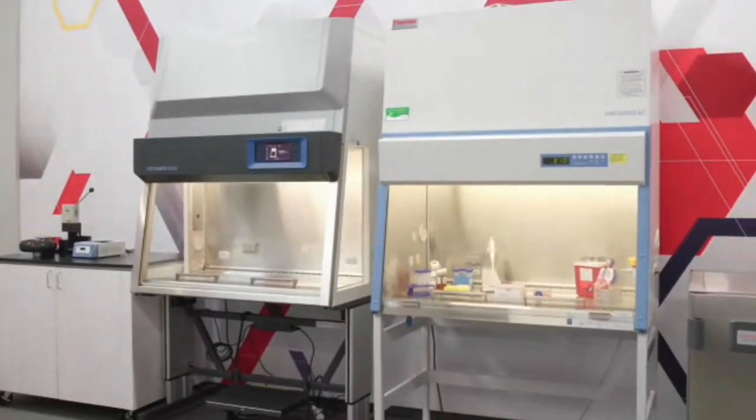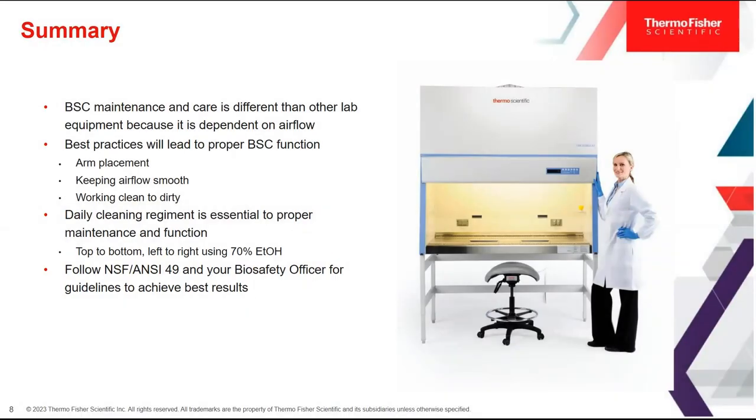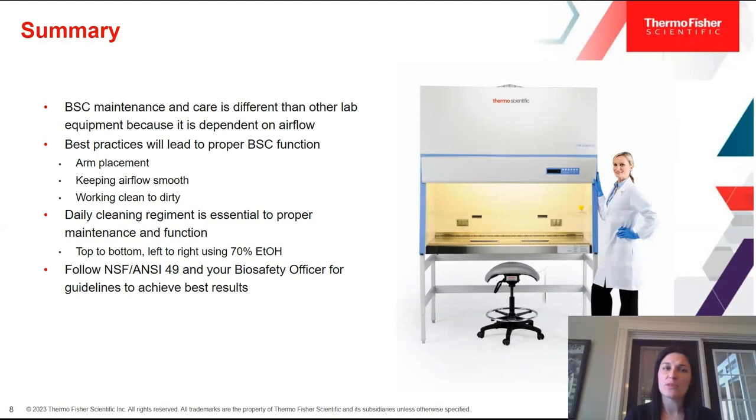Going back to the summary of what we've learned today: BSC maintenance and care is different from other lab equipment because it's so dependent on airflow. For best practices, we talked about using a stainless steel armrest so you don't block the front grill, keeping the airflow smooth and making sure nobody's running by you, avoiding repetitive in-and-out motions, working from clean to dirty in sequential order, and a daily cleaning regimen using 70% ethanol cleaning top to bottom, left to right, following NSF guidelines and your biosafety officer's recommendations.